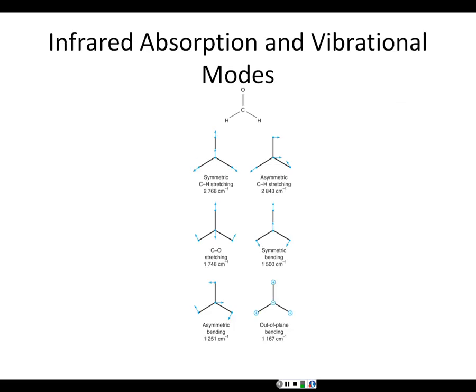In infrared, again, we're looking at vibrational modes. When a molecule picks up or absorbs infrared radiation, it can cause the molecule to vibrate. That has to do with whether or not the molecule experiences a change in polarity with that vibrational mode. We define several different modes. In a symmetric stretch, the bonds are lengthening and contracting at the same time. So if you have a molecule that is symmetrical, during a symmetric stretch, the dipole moment does not change. In asymmetric stretching, some of the bonds may be expanding while other bonds are contracting.